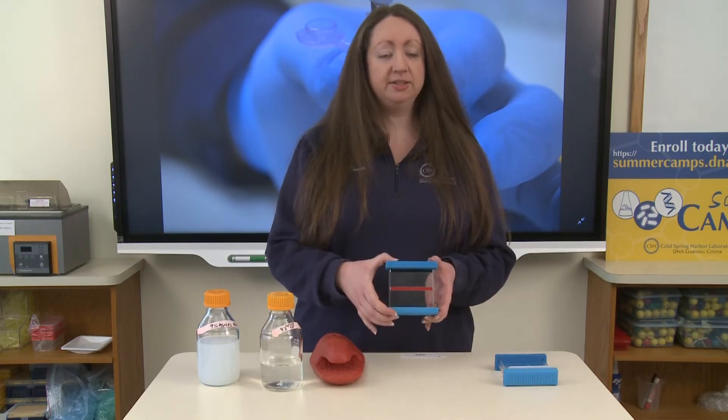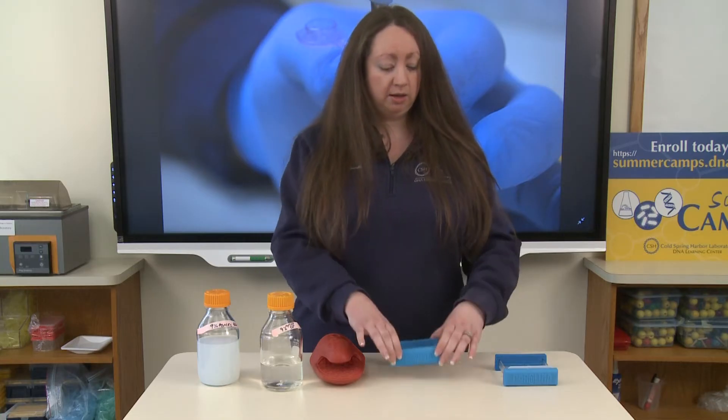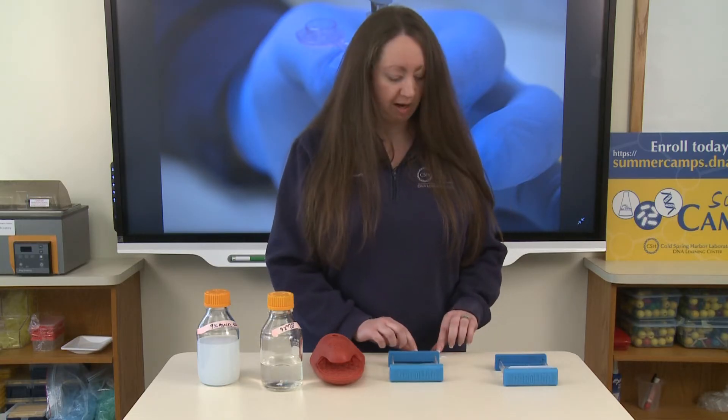The reason that these casting trays do not come fully enclosed all the time is because we need to be able to run an electric current through this agarose gel to migrate and mobilize our DNA through that gel. Plastic on all four sides of the casting tray would prevent the electricity from running through our gel.